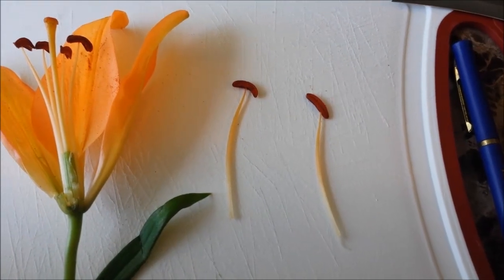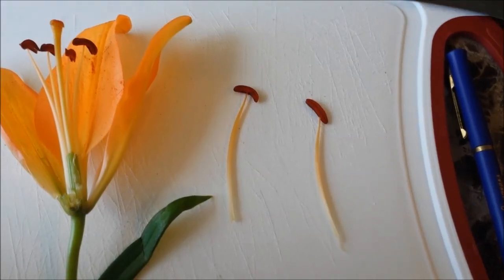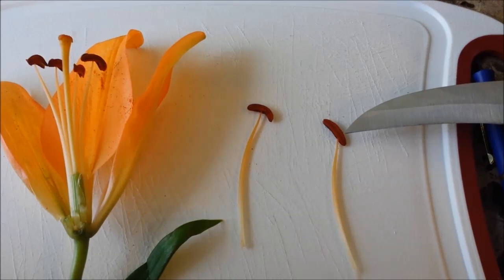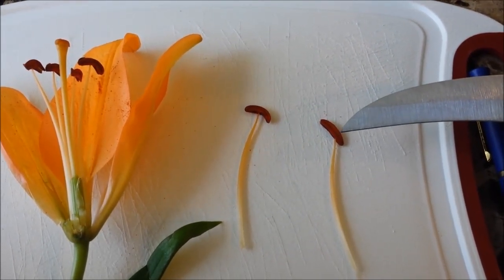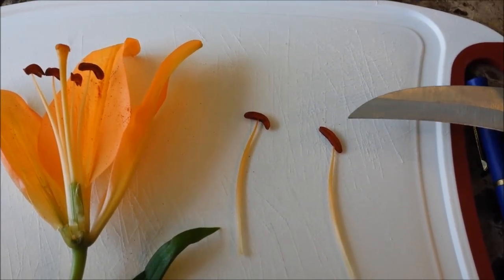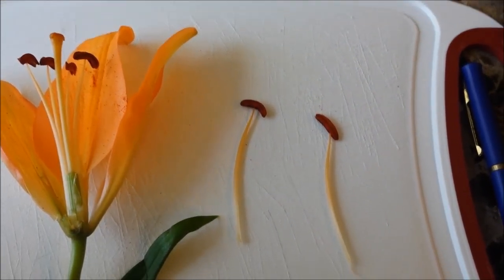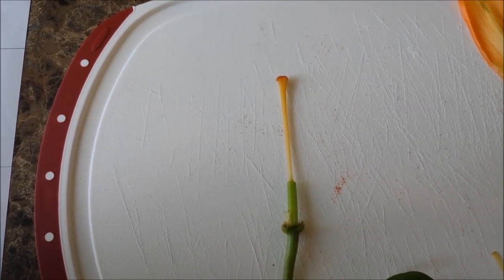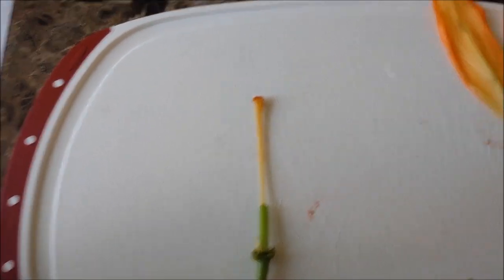Okay, so we have 2 stamens removed from the flower, and now the stamen consists of the anther, which is right here, and the filament, which is this long part right here. The anther is what holds the pollen of the flower. So you're going to go ahead and remove the anther from the filament, and then you can place that onto your paper. This part, you can see that I've removed the rest of the sepals, the rest of the petals, and the rest of the stamen from the flower.